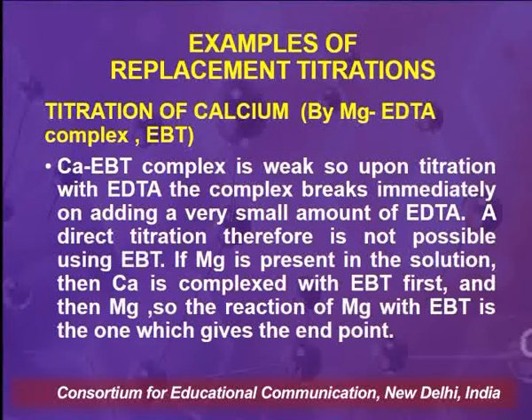If magnesium is present in the solution, as in case of hard water or as in case of a mixture of calcium and magnesium in a particular solution, then calcium is complexed with EBT first and then magnesium.